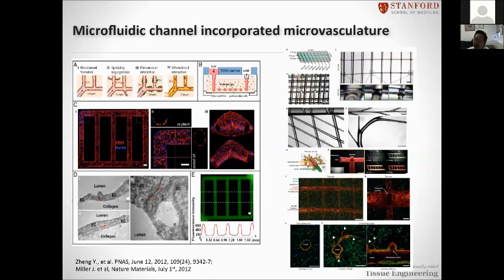Hydrogel is basically 95% or 99% water, with only 1% to 5% polymer network. So this polymer network can contain the cell. Because the sugar forms a network, the sugar will dissolve out into the water, leaving open space, the lumen. We can use this lumen for perfusion. So this is the current state of the art.